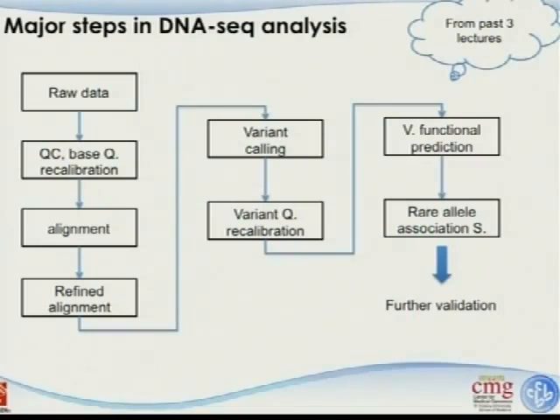And next, you will do the alignment part, which we also talked about extensively in the second lecture, and which we'll briefly touch on a little bit today as well. And we mentioned the importance of refined alignment. Keep in mind that for the initial alignment, most of those short-read aligners do not do very well in the insertion-deletion regions. So sometimes they really give you false positive or false negative alignments there.